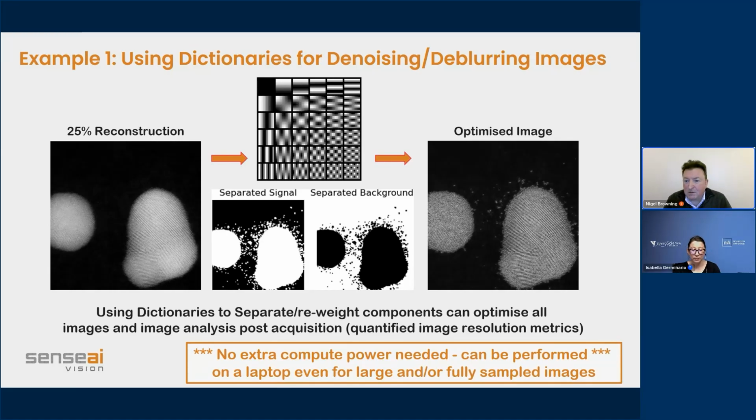It's not something that we have particularly done so far. And the reason for that is that on all of the microscopes that we've applied this to, the speed of the imaging is such that we can actually get a full image before we have to do it. You can see it on these gold nanoparticle images. There is some drift in there, but some of that's caused because we're changing the magnification sequentially, and that will affect the process that goes on. But absolutely, drift correction is part of our development process, and we expect to have something on that coming up later in the year, maybe into next year.